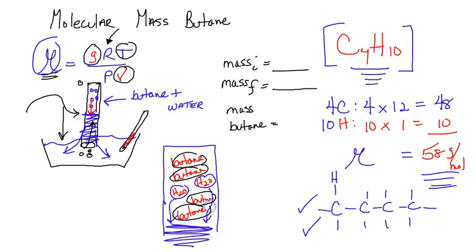So what do we know? Well, we know something very special. When we have gases under the same conditions of temperature and pressure, the ratio of how many particles is the ratio of their pressure. These gases are pretty much under the same temperature and pressure. They're in the same space. So we learned by Avogadro's hypothesis that volume and number of particles are proportionate.